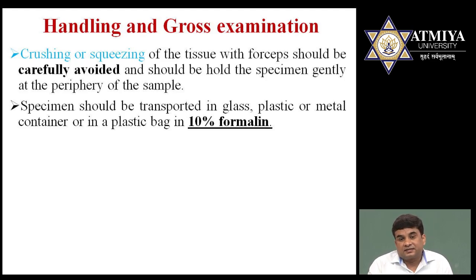After collecting the samples, you have to immediately transfer them to liquid formalin. If you delay, then autolysis of the tissue will start just after removal from the body. So here you should be very fast. If you do this carefully, the tissue sample will not be destroyed and all the morphology, all the structure will be maintained.